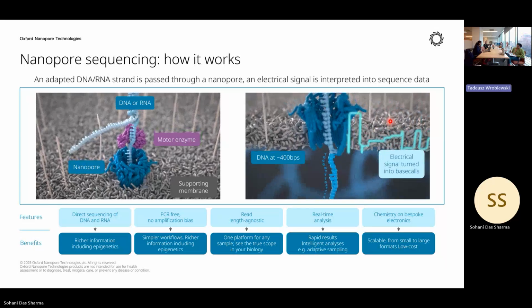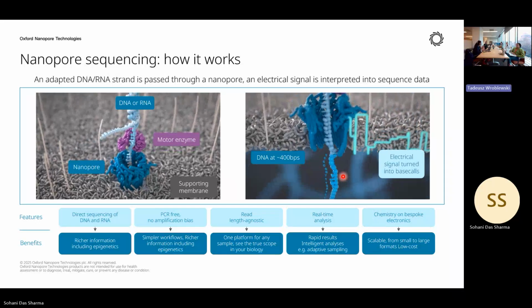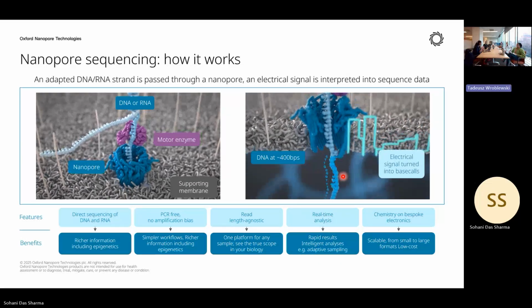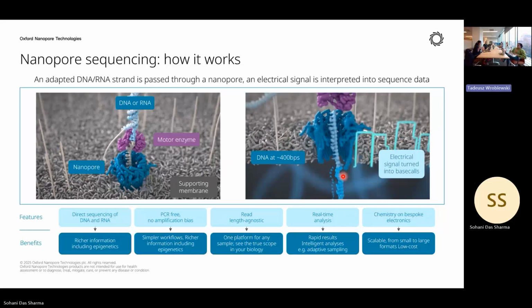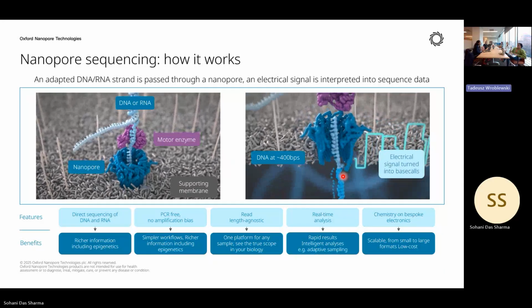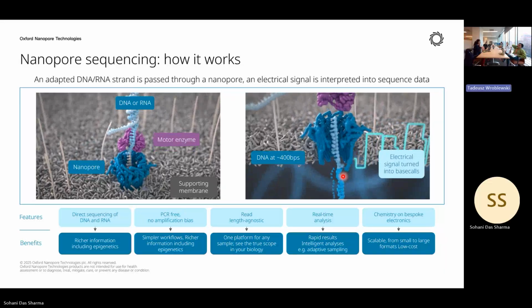in real time. I will go over this base calling mechanism, or how our software is deconvoluting the signal, more tomorrow. I am using very simplified words, but it is actually a very complex algorithm and a very highly trained model that we use. So we don't need to understand everything if we are not part of a software development group, but I will show you at least the basic pipeline, how the base calling model works.